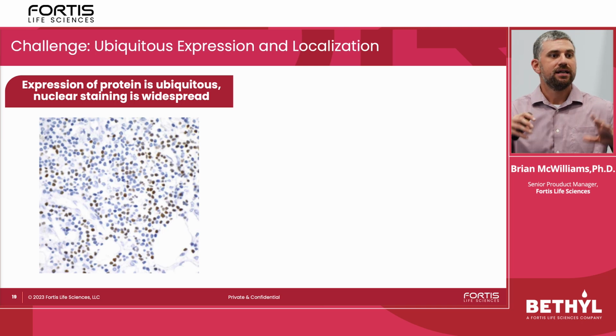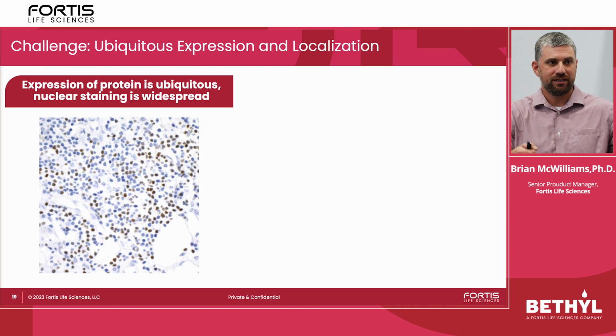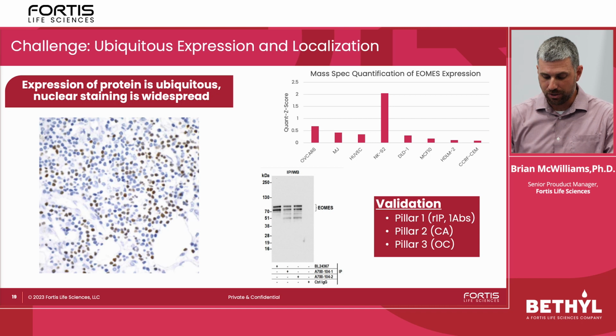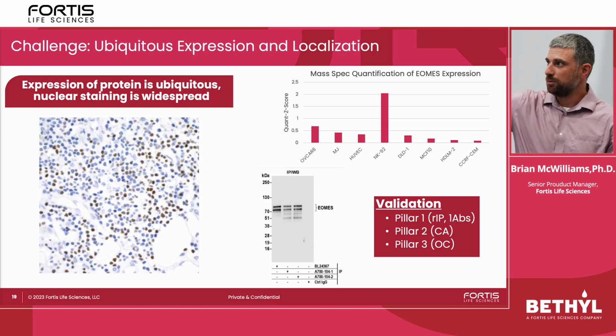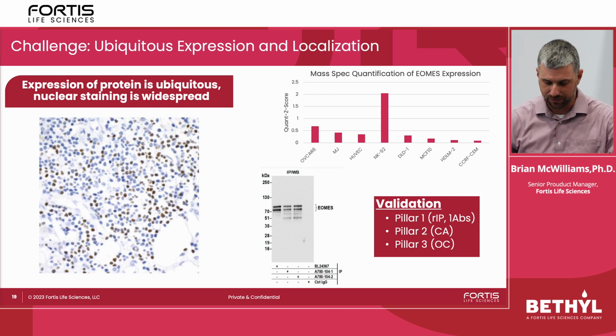So as you guys know, if a protein is being expressed at a high level across multiple cell lines, and you see a band in all these different cell lines, you don't really have a negative control there to give you confidence that, hey, this is what we say it is. So we're able to use our pillar system to say, okay, let's use the orthogonal characteristics and say, hey, this is very highly expressed in NK92 cells. Let's run a reciprocal IP now with 2 different antibodies against different epitopes of the same target. We're seeing this nice clean banding pattern here. We know that that is what we say it is, okay?